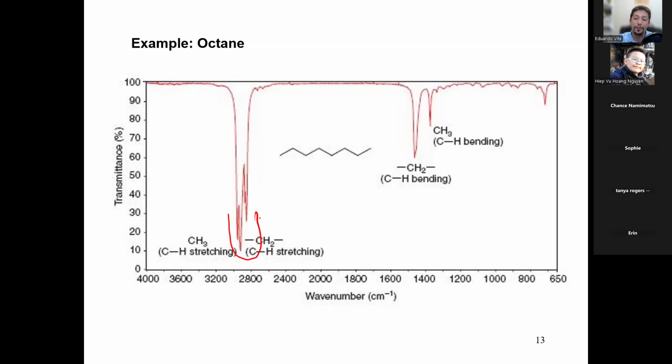All spectra have this. You need to know what it is. You need to be able to tell me what it is. But since it's everywhere, knowing it doesn't give you any points. You need to be able to tell it apart from other ones. So yeah, once you know what it is, that's great. But that's like being able to say, I can count to 1. Look, 1. Well, that's cool. All the other numbers are built off of 1, right? So all of the rest of the analysis is based off of what's different from this CH stretching. Make sense?